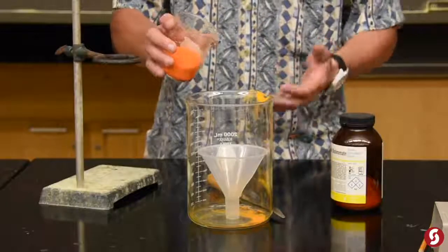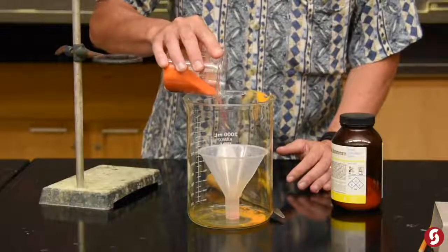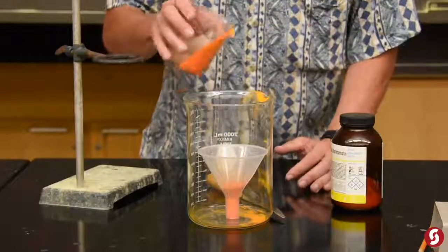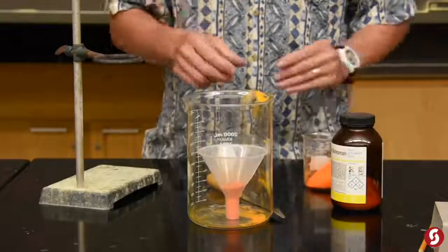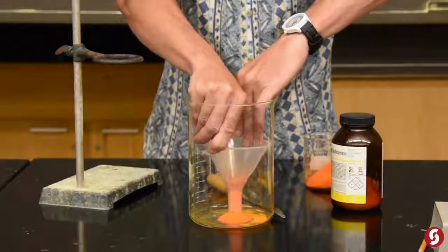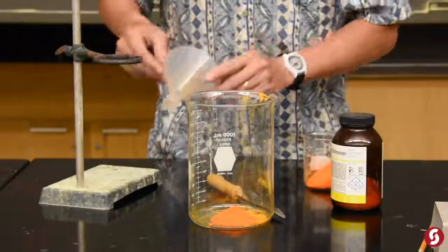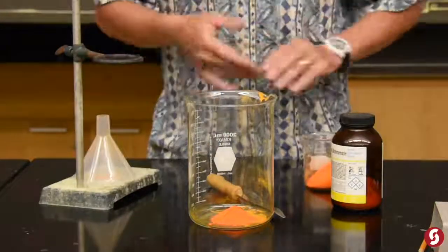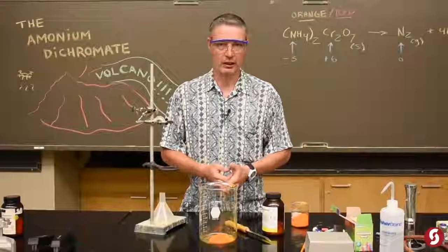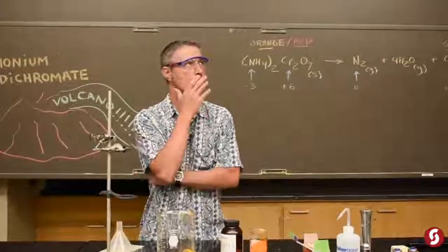Here's ammonium dichromate. What I'm going to try to do is make a really concise sort of pile of it by putting it into this funnel and then lifting the funnel out — that's going to be kind of the base of our volcano. It's got this reddish orange color, very unique, and it kind of reminds me of something, though I can't quite place what.